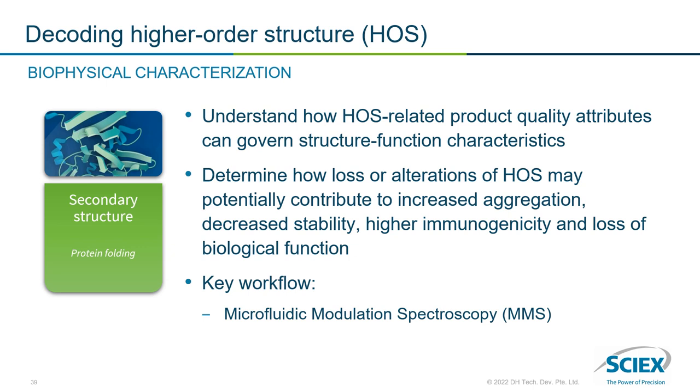I will now focus on higher order structure characterization of proteins. Protein structure, specifically higher order structure, is critical to a protein's function and biological activity. Additionally, the structure is critically linked to its stability, immunogenicity, and potential to aggregate, all critical parameters when developing biologic drugs. I will be focusing on structural characterization utilizing microfluidic modulation spectroscopy, a technology developed by Redshift Bio and commercialized in the AQS3 Pro and Apollo systems.